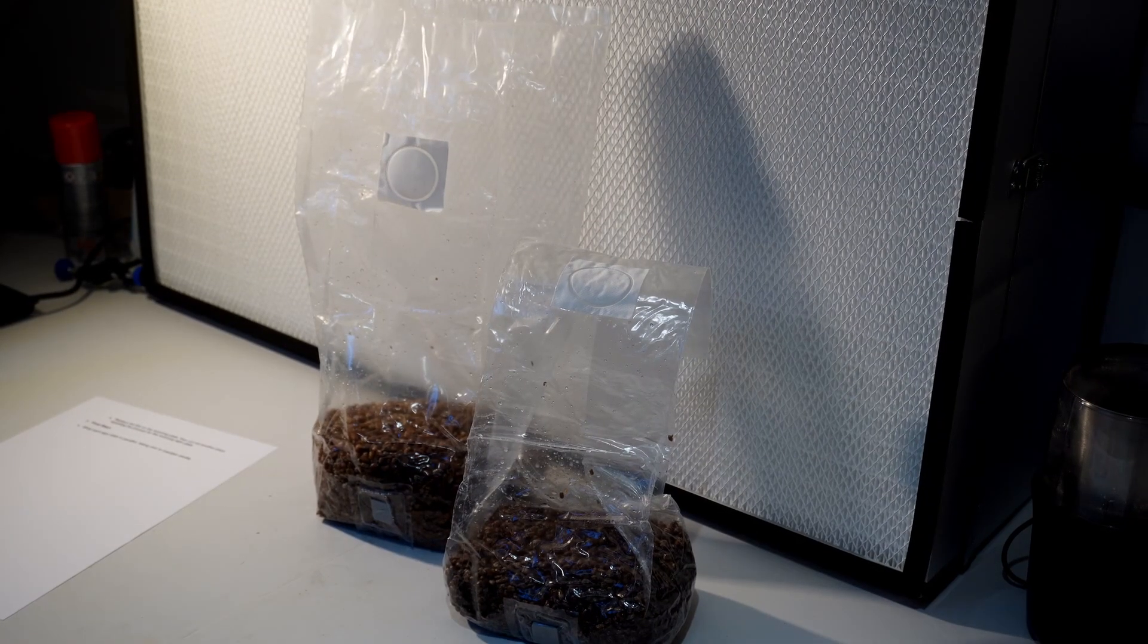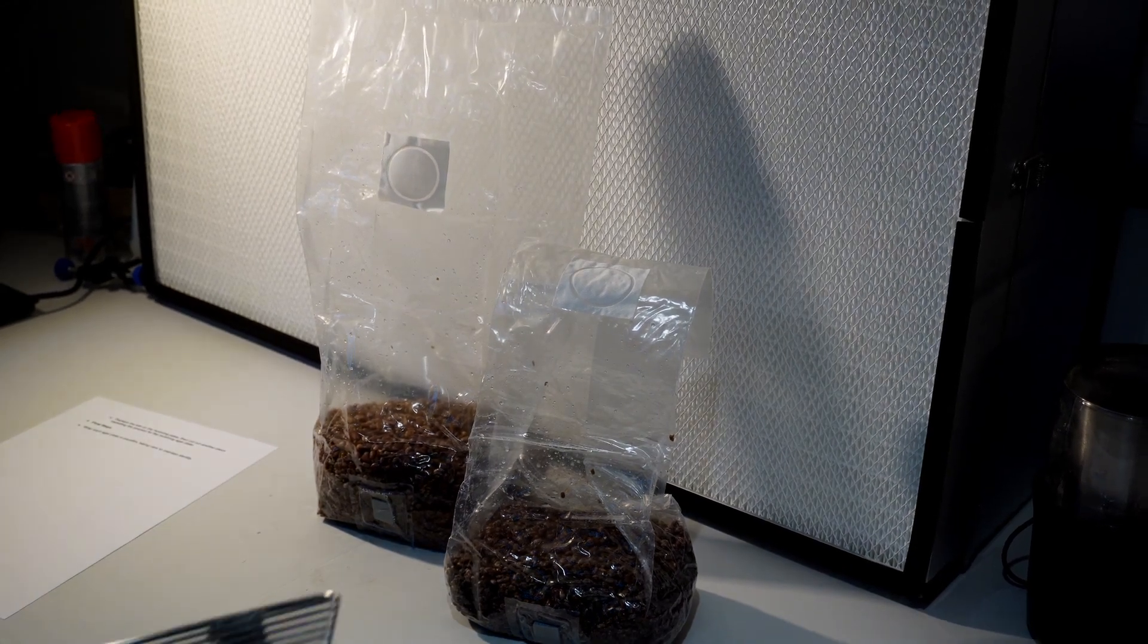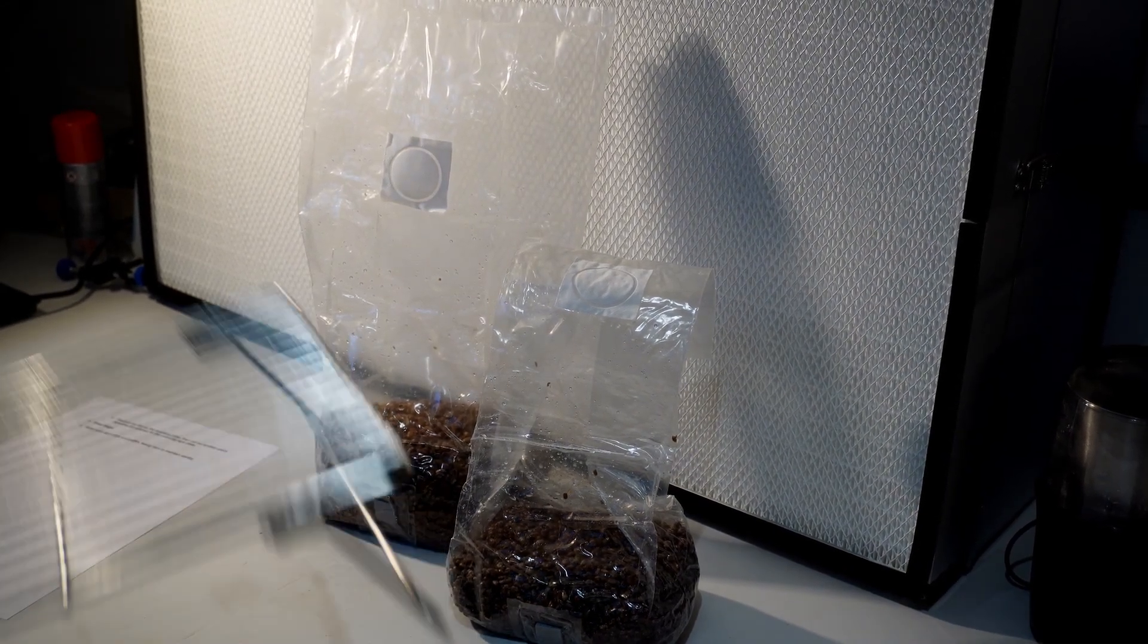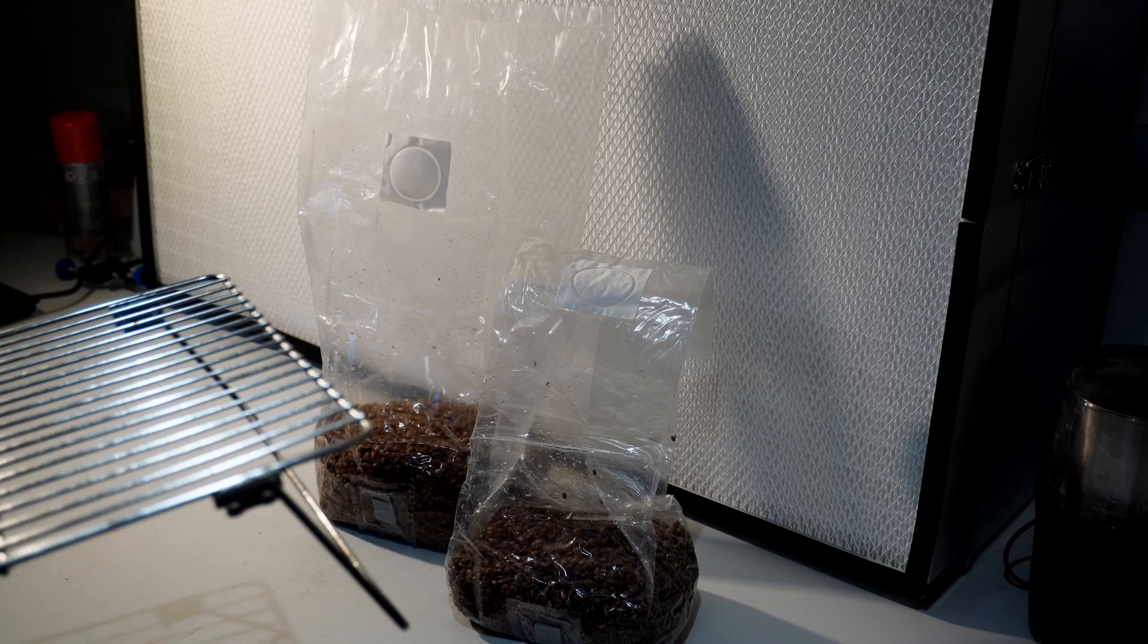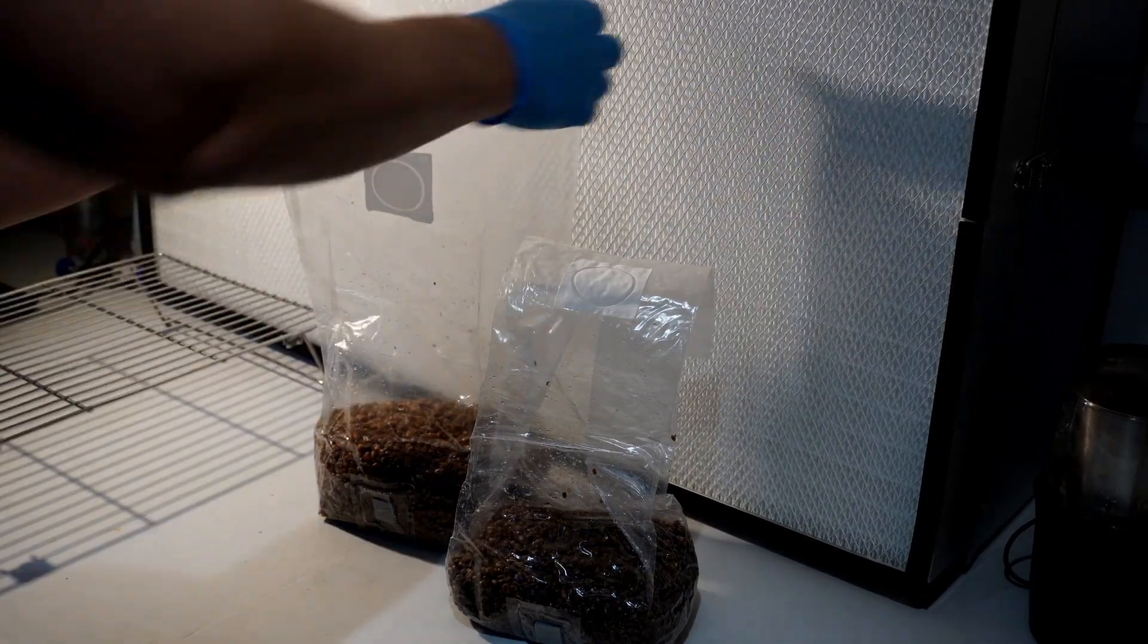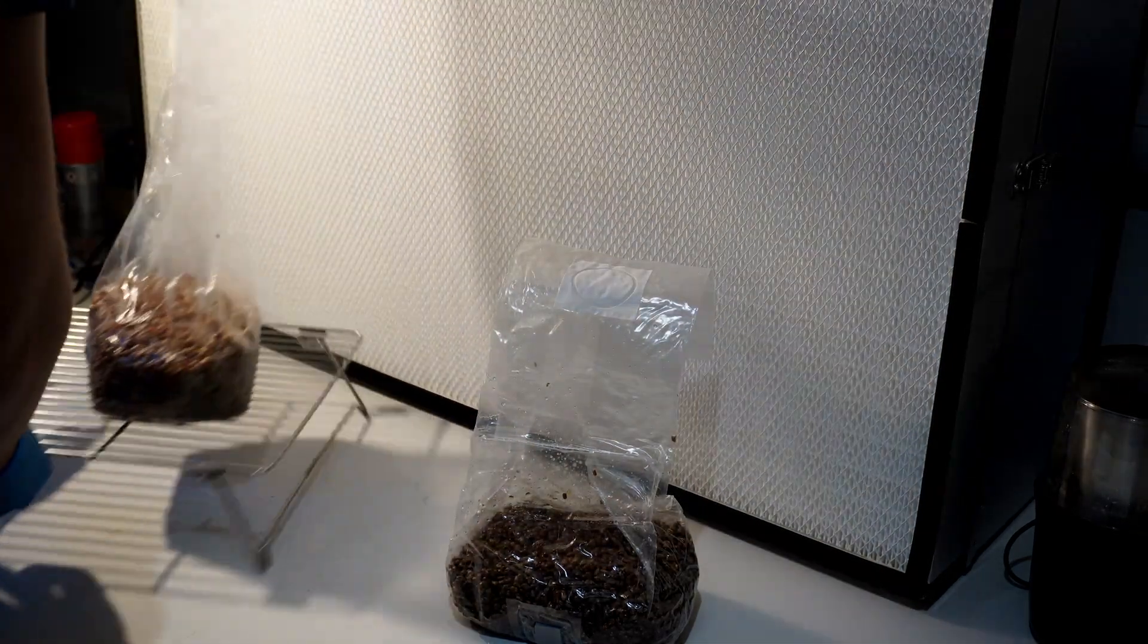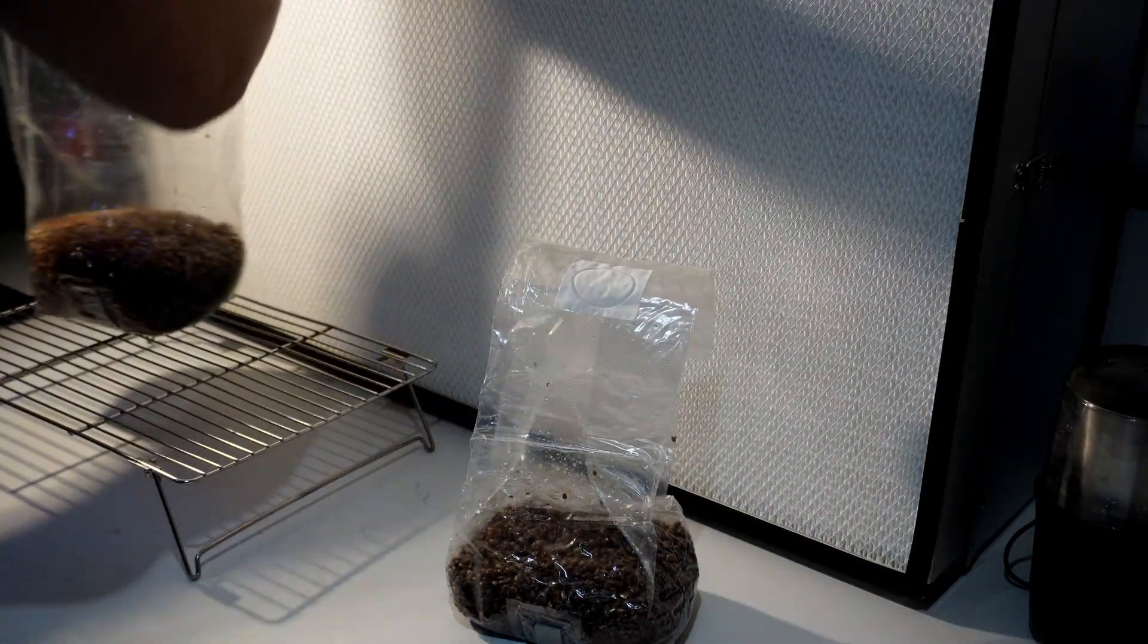This time I'm going to be showing you how to do it in front of a laminar flow hood or fan filter unit as I am using here. These bags I sealed earlier using an impulse sealer and first thing you're going to want to do is raise the grains up off the ground using a wire rack so that the actual sterilized grain is in front of the filtered air.